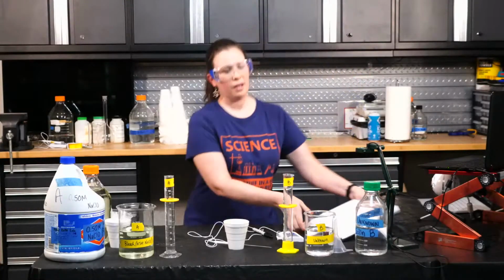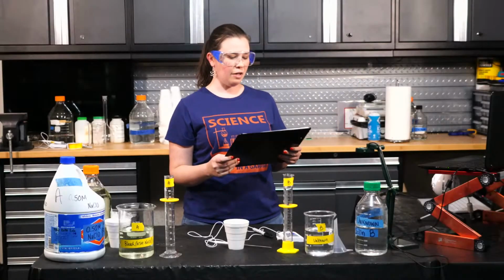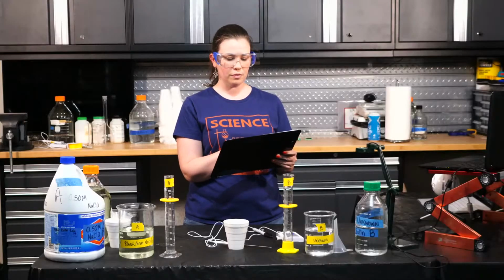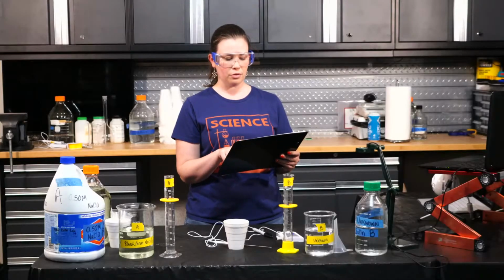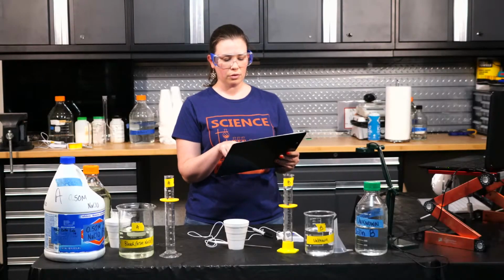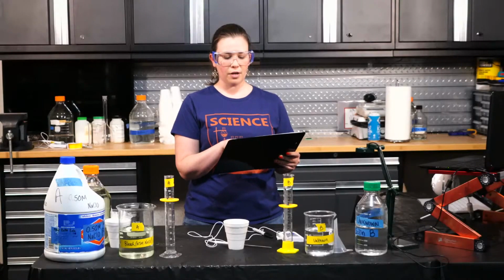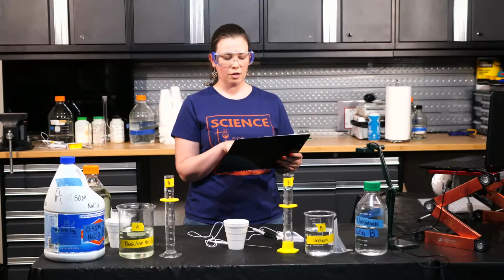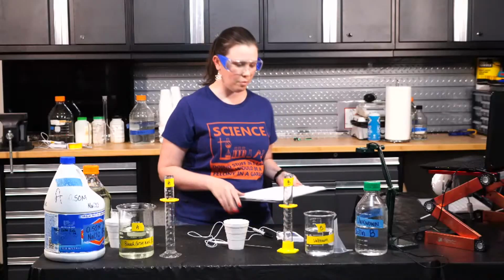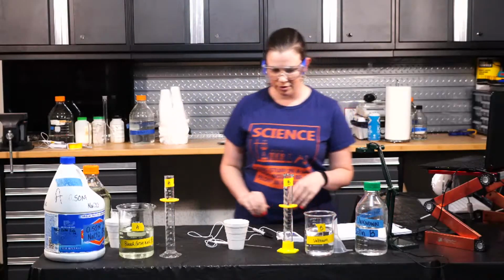All right, so we have our levels. Level 1 will be 5 milliliters of bleach to 45 milliliters of solution B. Level 2 will be 15 milliliters of bleach, 35 milliliters of solution B. Level 3, 25 to 25. Level 4, 35 milliliters of bleach to 15 milliliters of solution B. Level 5, 45 milliliters of bleach and 5 milliliters of solution B. Get your information from your lab leaders. Let's start with level 1.